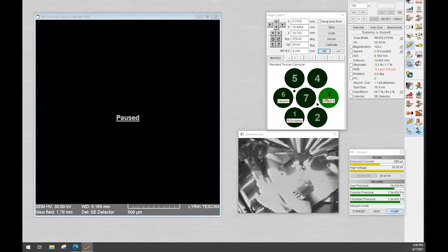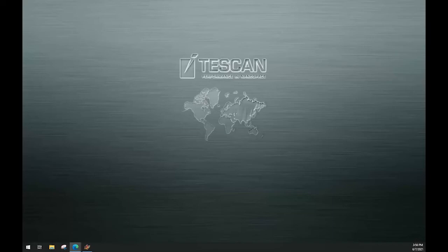Okay, I'm still waiting for the second one. It will be warmed up. I will stop sharing and I will start sharing again. Both of them.